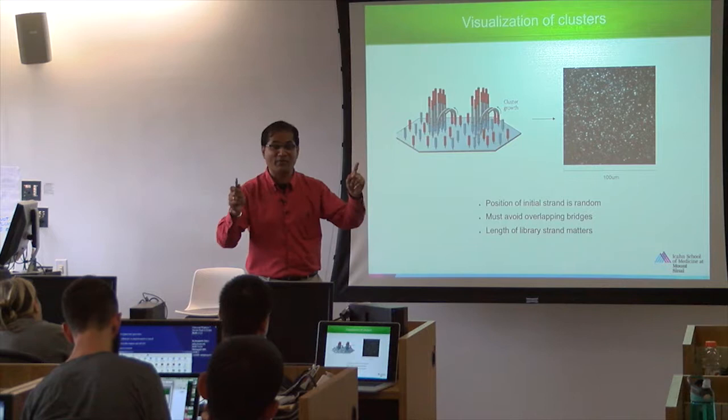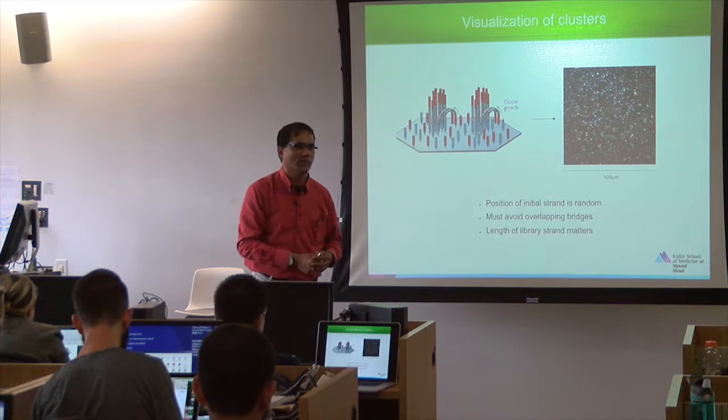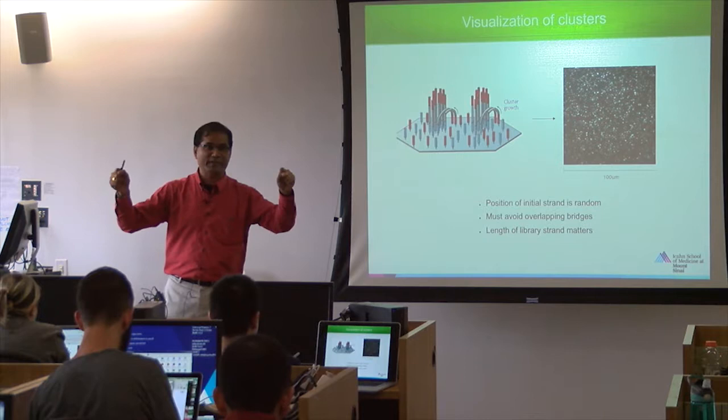When you talk about analysis or depth, you have to see whether depth is in terms of more bases per strand or more strands per genome in a given sample. These are important terminologies to understand: reads versus clusters, single end reads versus paired end reads, and what it means when you say depth. Is it sequence depth, or is it strand depth? Number of strands.